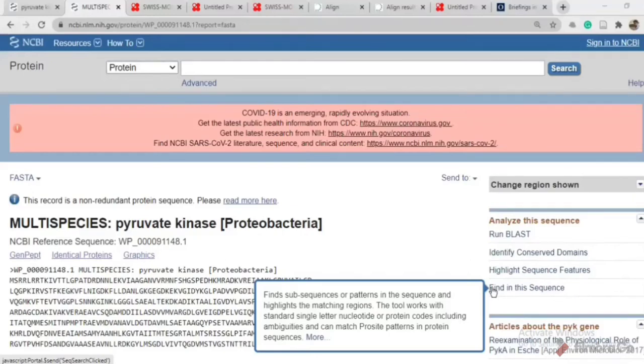In this video we are going to discuss how to obtain a Ramachandran plot, secondary structure prediction, and active site prediction of your protein of interest.